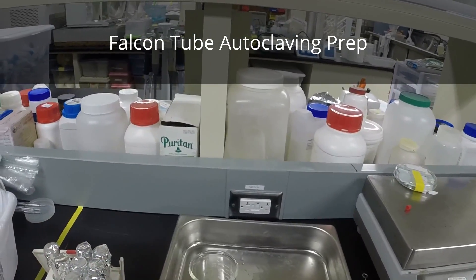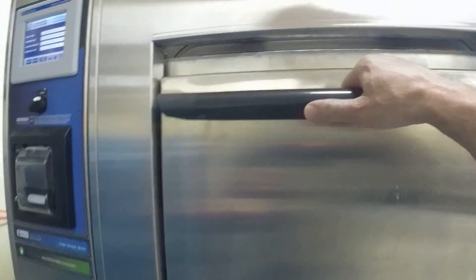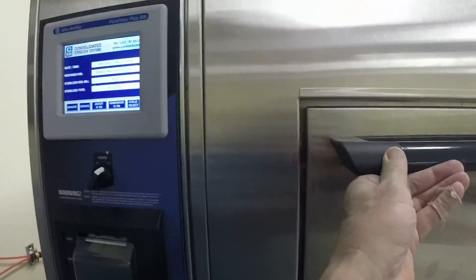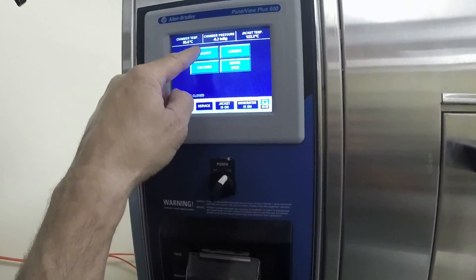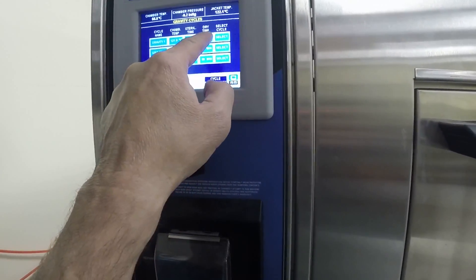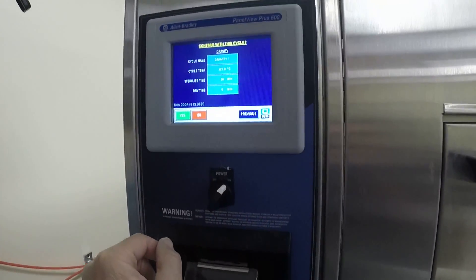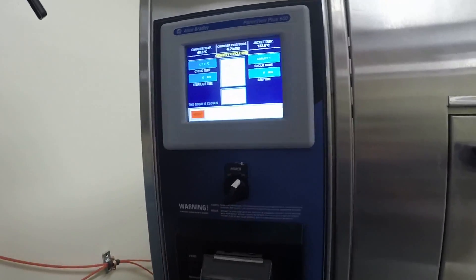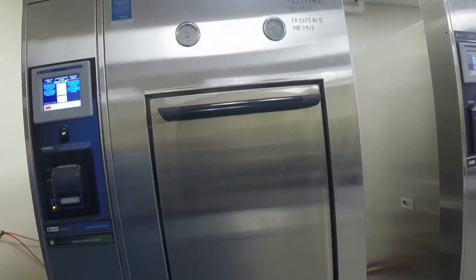These are our brand new autoclaves — pretty straightforward to use. I'm going to run these on the gravity cycle for 30 minutes. If you take a look up here, once you select the cycle, you can see the generator and jacket are both on. Gravity cycle selected, 30 minutes is fine. I really don't need a dry time, so I'm going to set that to zero. Hit select, then yes, and it'll engage the gasket and start the autoclave.